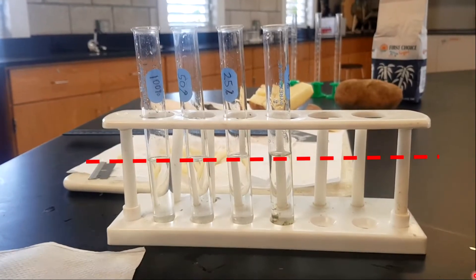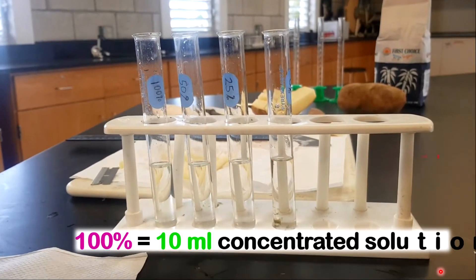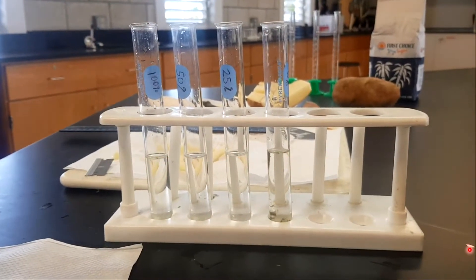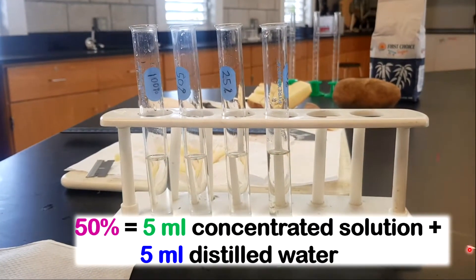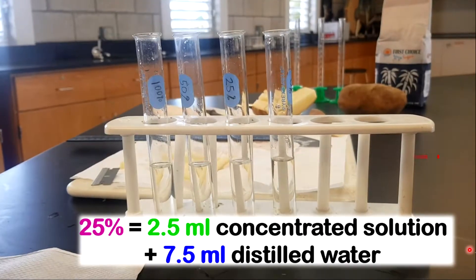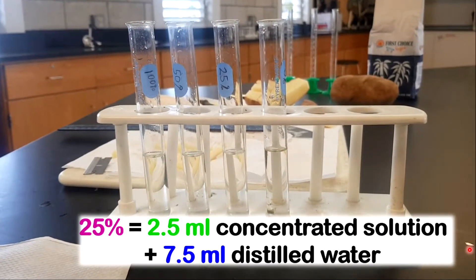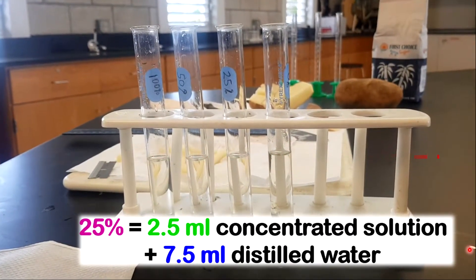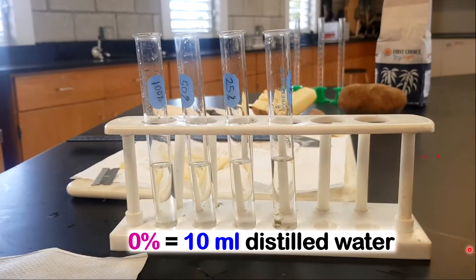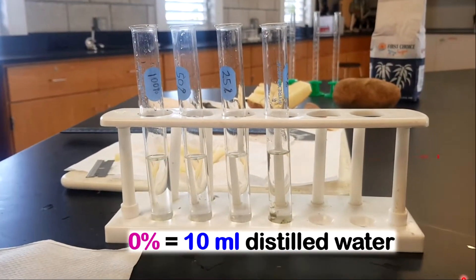To get your 100%, just put 10 ml of the concentrated sugar solution directly into your test tube. For the 50%: 5 ml of concentrated sugar solution and 5 ml of distilled water. For the 25%: 2.5 ml of sugar solution and 7.5 ml of distilled water. Notice all measurements go up to 10 ml. For 0% — no sugar at all — it's directly 10 ml of distilled water. All levels will be the same since they're the same total measurement.